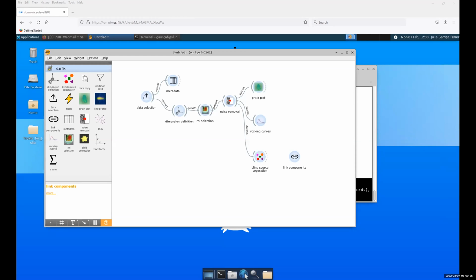And can we resolve the phase, if during a phase transition part of the grain has transformed into another phase? Yeah. I have done phase transitions a couple of times, and we normally track them down. We also have a diffraction camera, so you can see the full circle and identify them quite easily with that. In general, it should be possible. It's a bit less straightforward than just observing the image and seeing, oh, I have a distortion in this spacing, but you can definitely extract it afterwards.